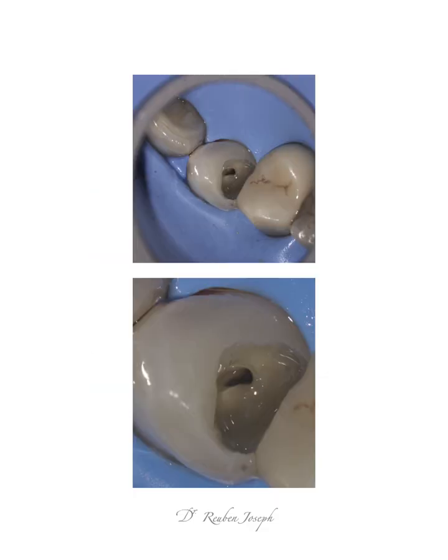So what you are looking at here is the very same image that you saw on the previous slide, but the only difference in the image on top is that I have included some amount of the surrounding structures as well, and what you can appreciate is this image definitely looks a lot brighter and sharper as compared to the one below where I've cropped too close.